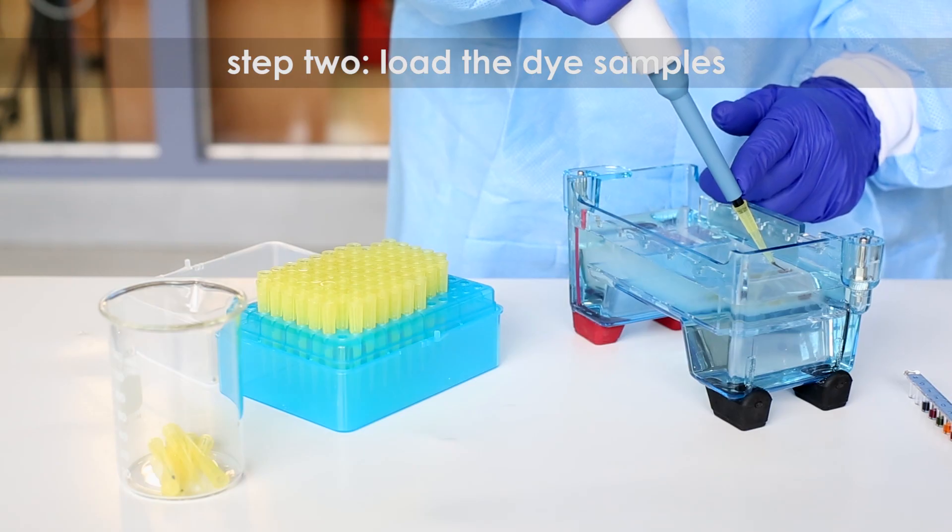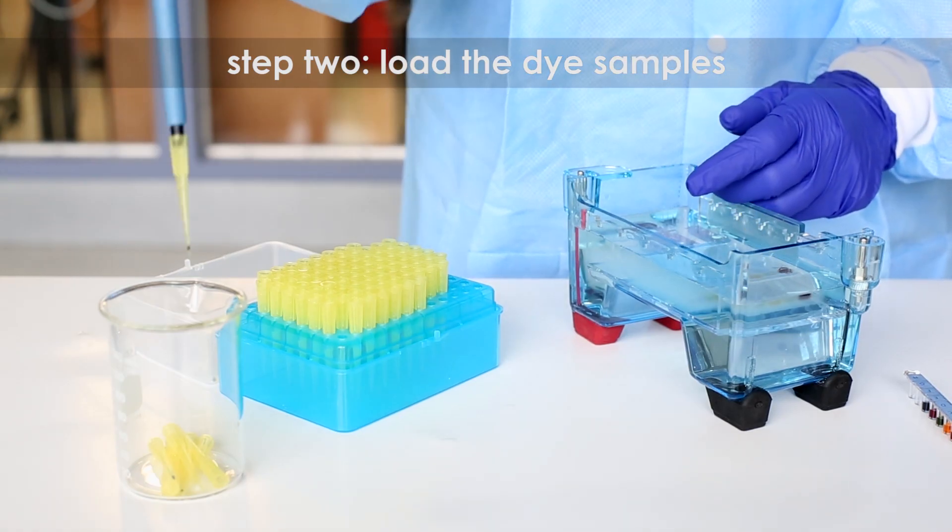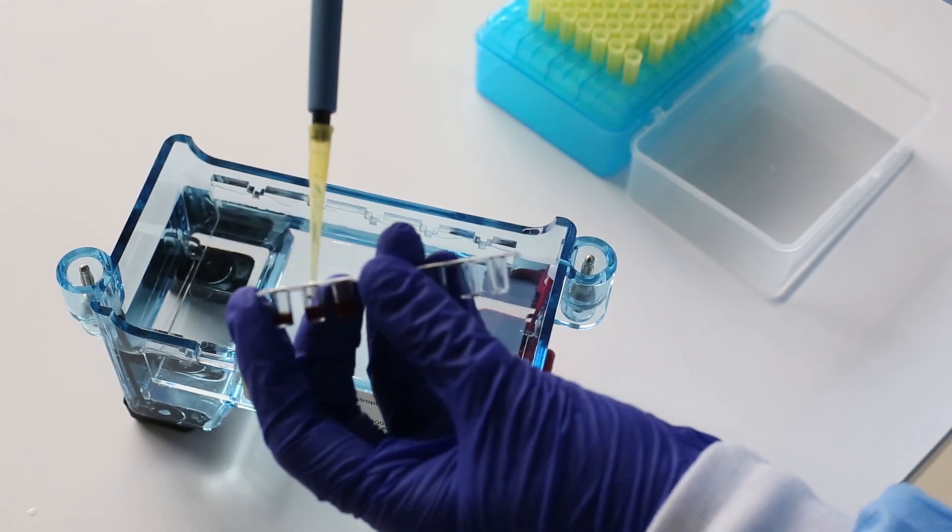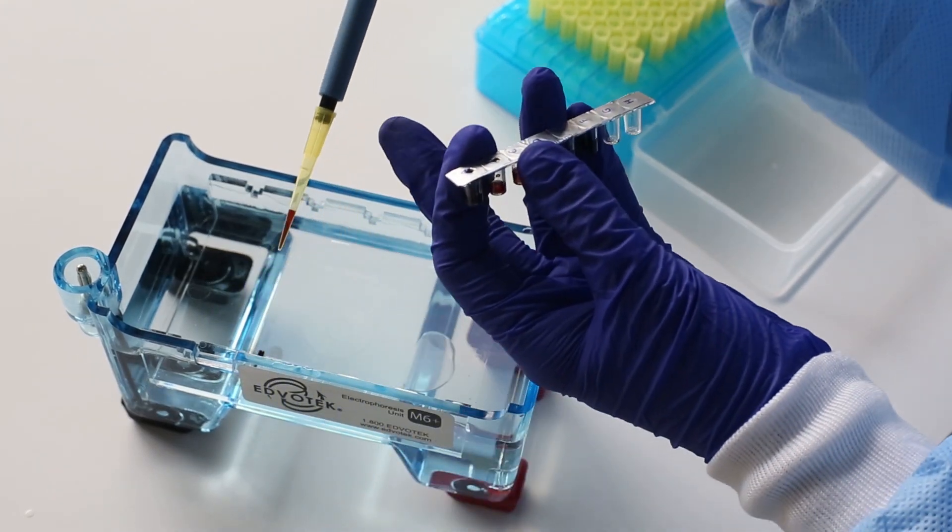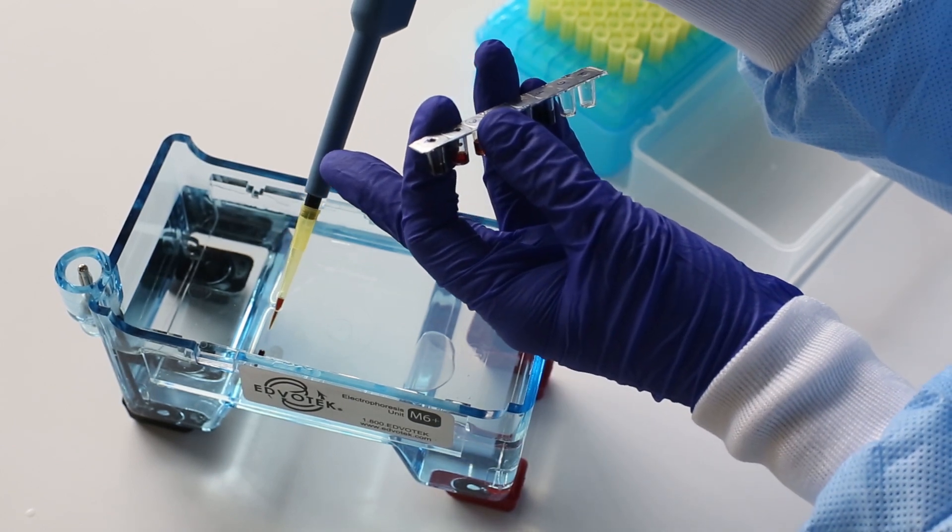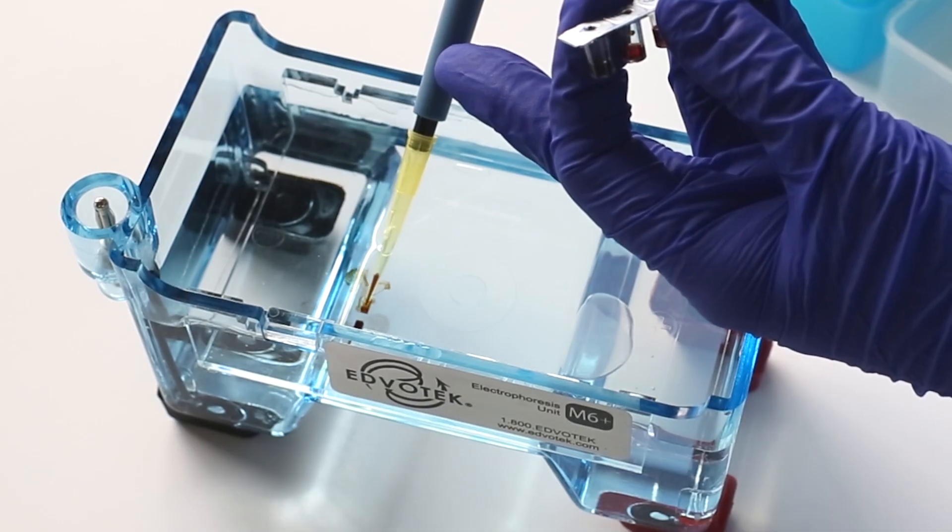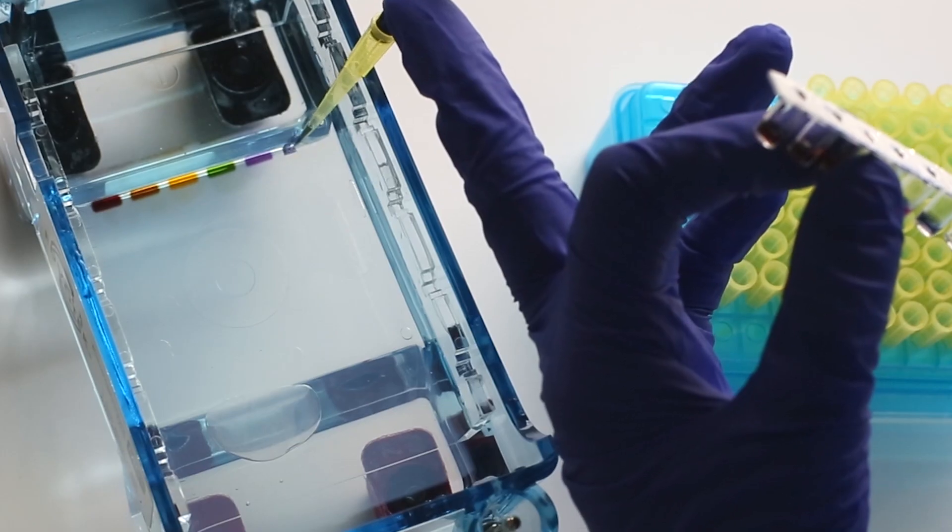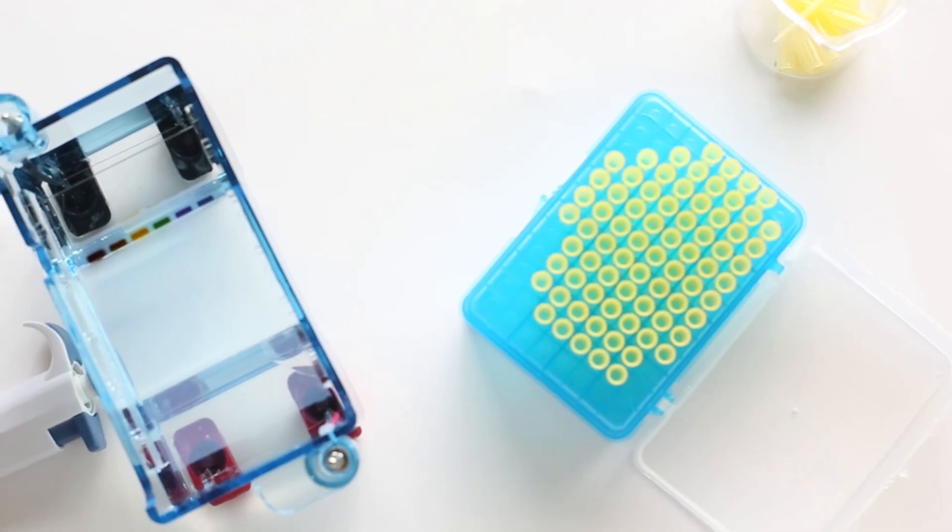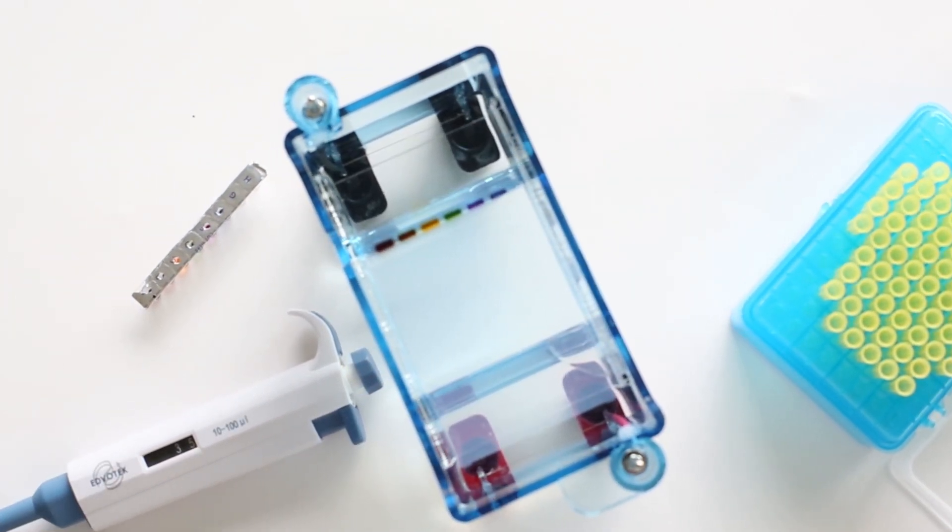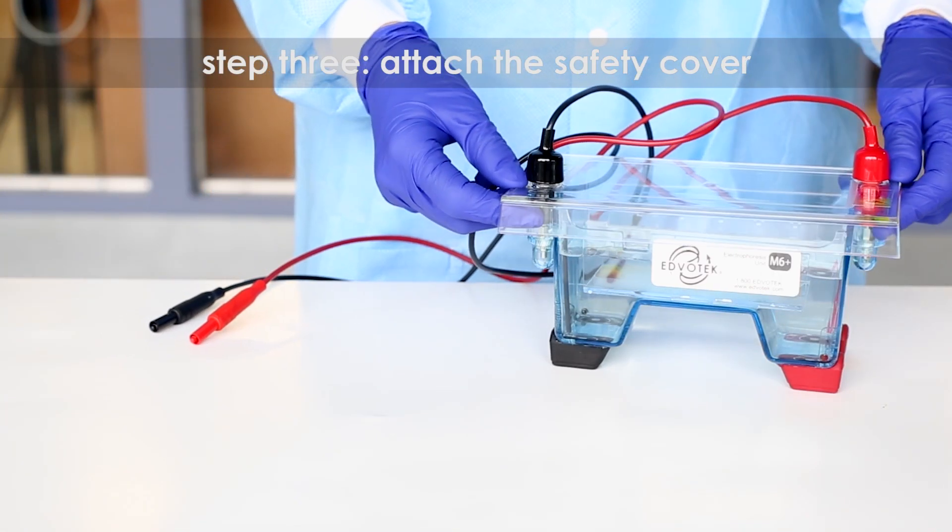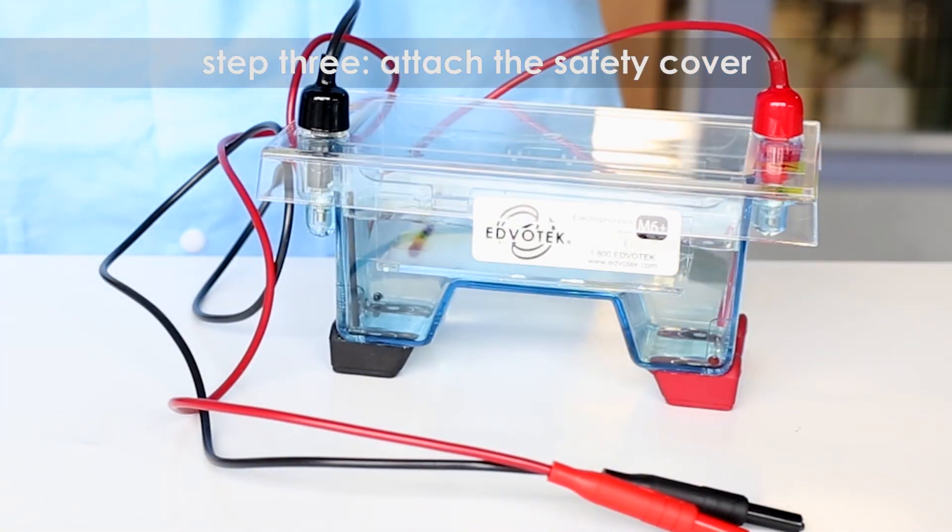Step three: place the safety cover and check that the gel is properly oriented. Remember, the dye samples will migrate toward the positive electrode.